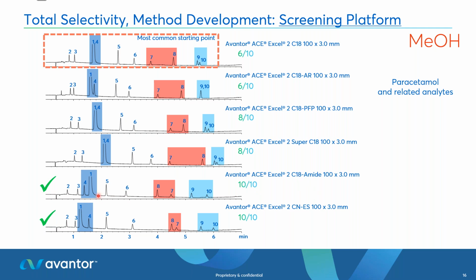And you've got a reverse elution order there. In my eyes, that's much easier to work with, having that analyte elute before the main API, because if that's a much smaller peak, you're going to be able to see it even if this API peak is very tailed and overloaded.